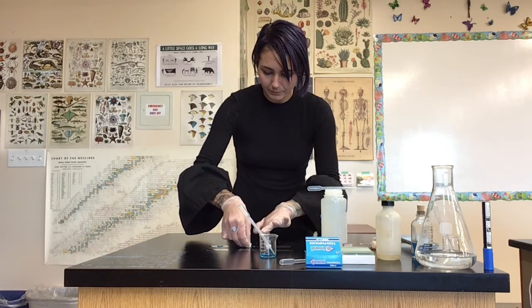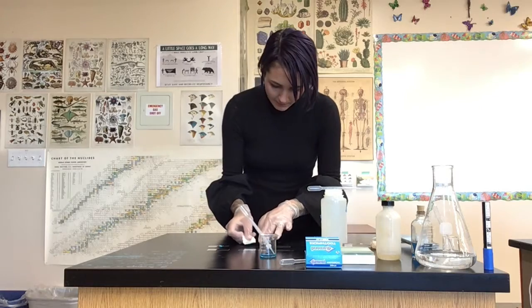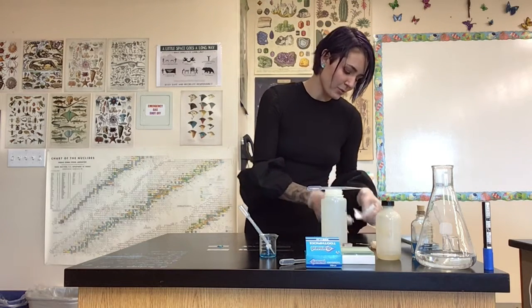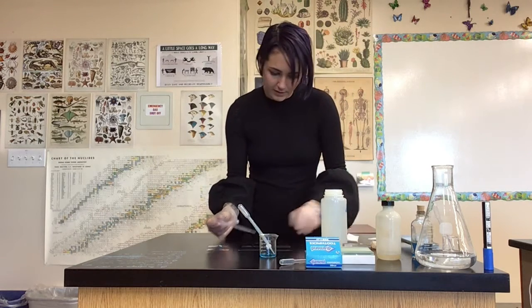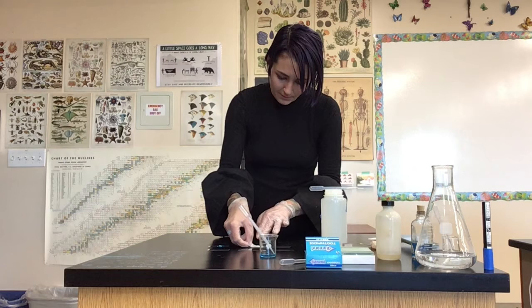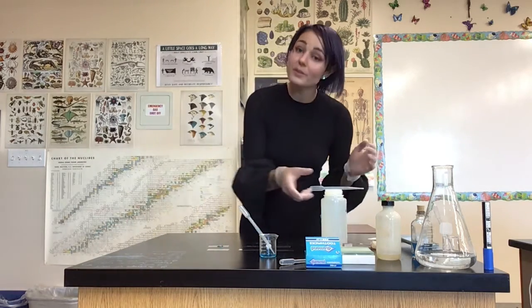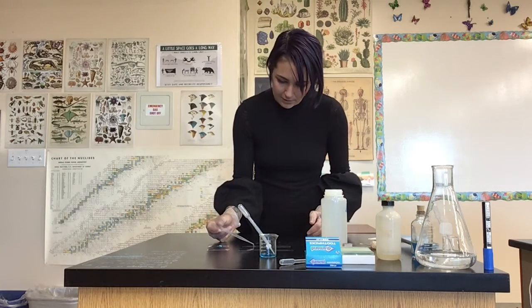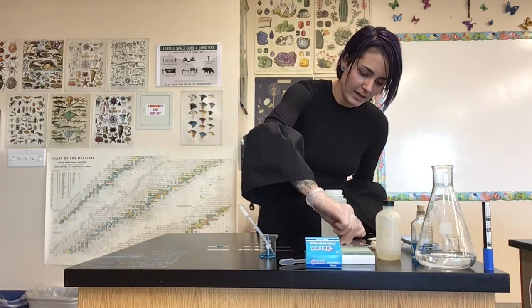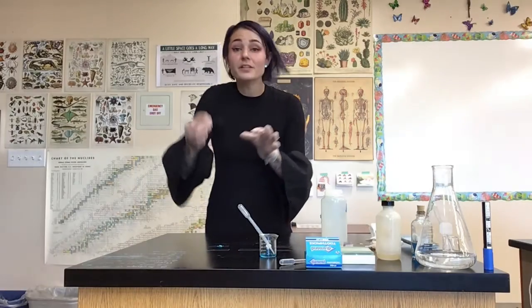What I'm going to do now is soak up the methylene blue from my cheek cells, soak up any of the excess, and then rinse off my cheek cells with some deionized water so that all we see stained blue is just the cells and the parts of the cell, like DNA, that we are trying to see. I'm hoping I don't absorb up all of my cheek cells in the process, but we will know when we look at it under a microscope. I put some deionized water down, and then I'm going to put a slide cover on top. I've got this slide prepared while the methylene blue soaks the cells. Let's go see if we can find some cheek cells under a microscope.